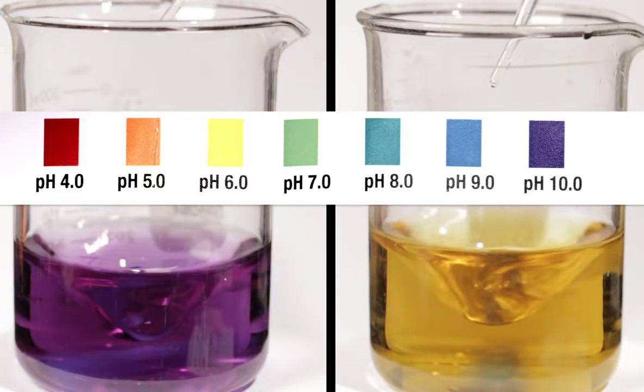It only took one drop of strong base to dramatically raise the pH of solution A. After one drop, the pH of solution B hasn't changed.